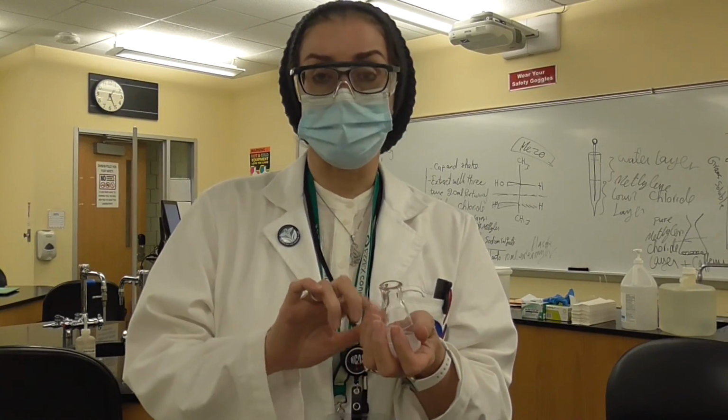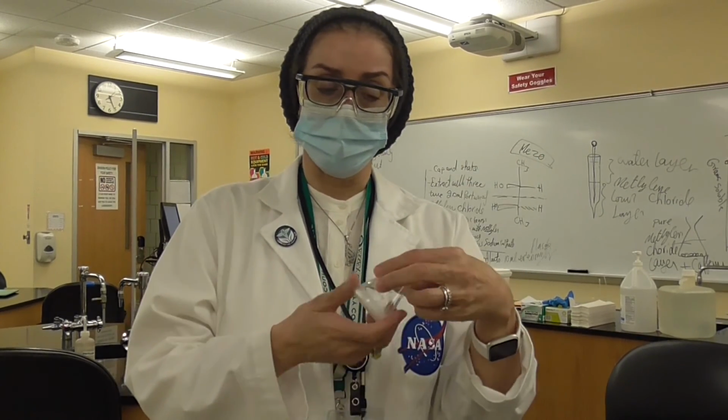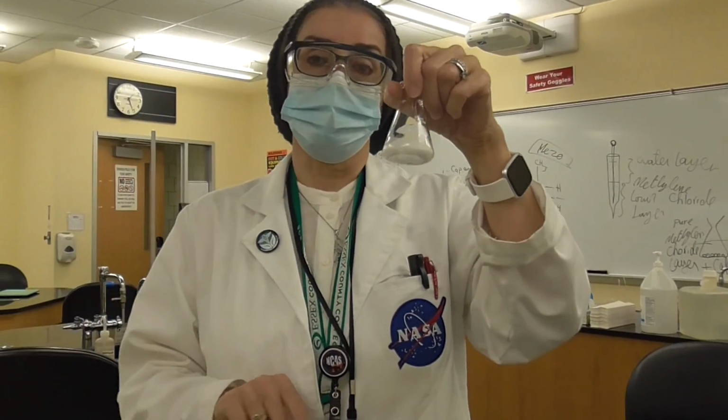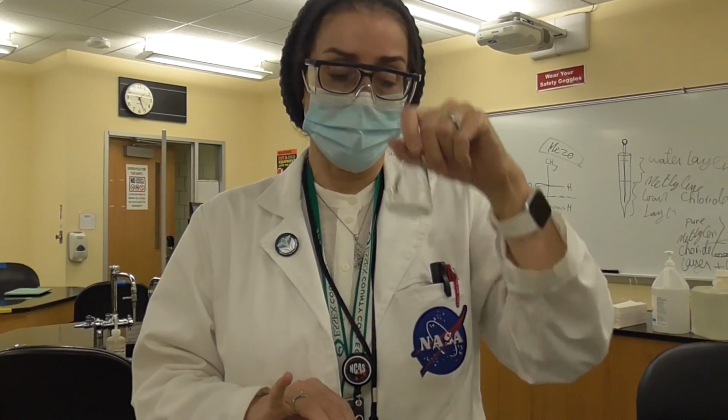We will wait until we make sure it is cold before we take it to the balance, and then we're going to weigh that, and we take off the weight of the container, which is the 50 ml Erlenmeyer flask. We will be able to weigh the final pure extracted caffeine from methylene chloride. Thank you very much.